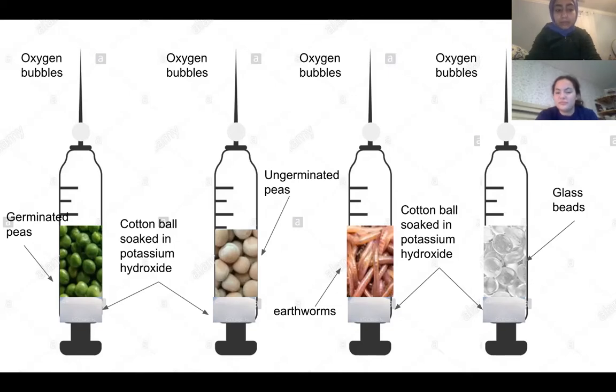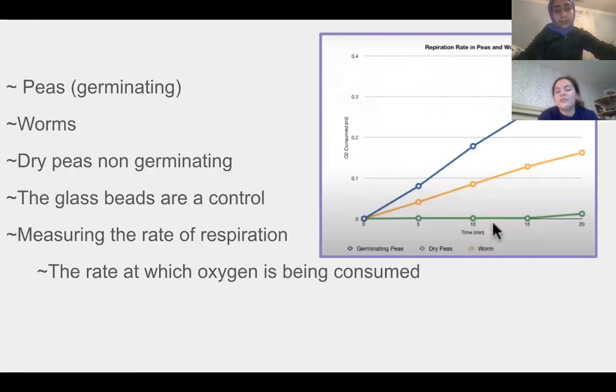And so the volume inside when it's put into the water will decrease, and the oxygen bubbles, as we showed, will just keep getting closer in time. And then in the end, we look at the chart. And this is all taken on a respirometer.